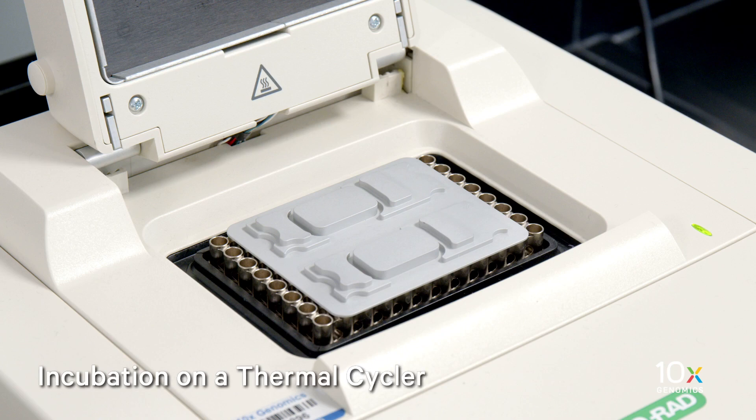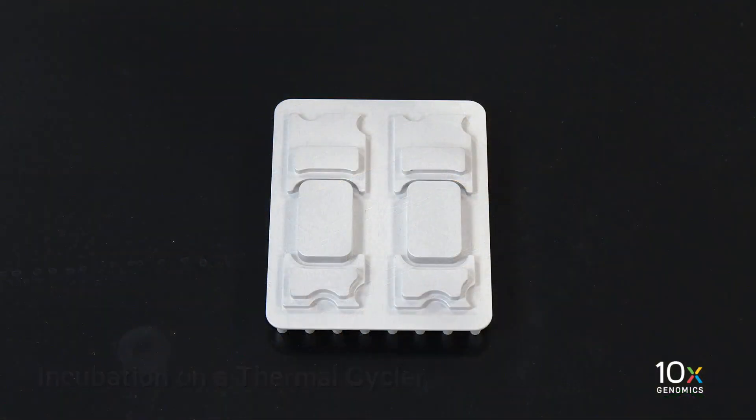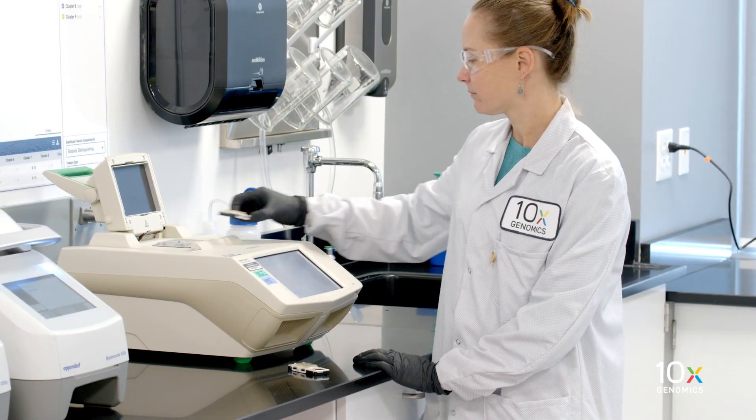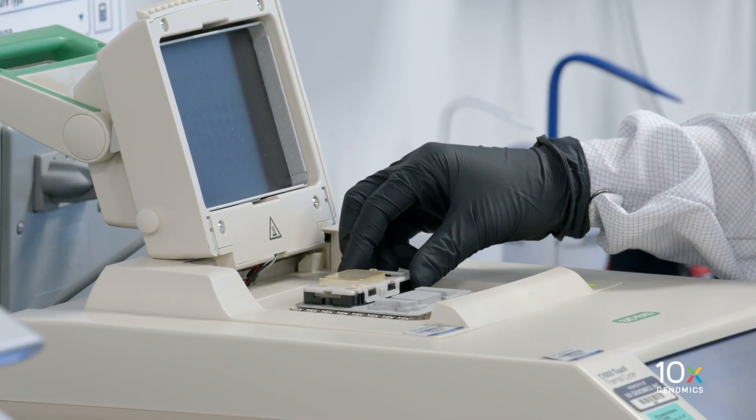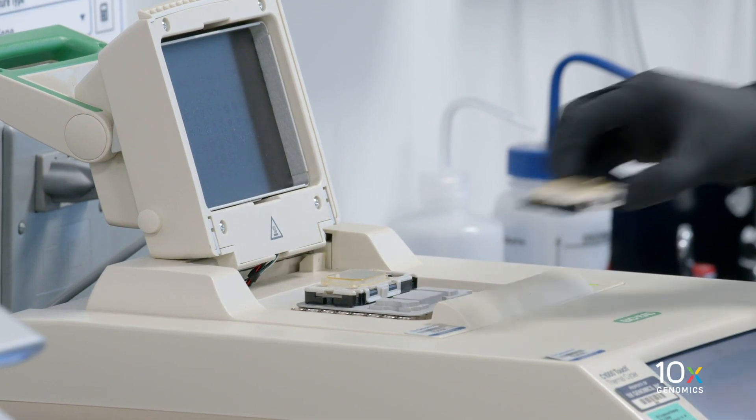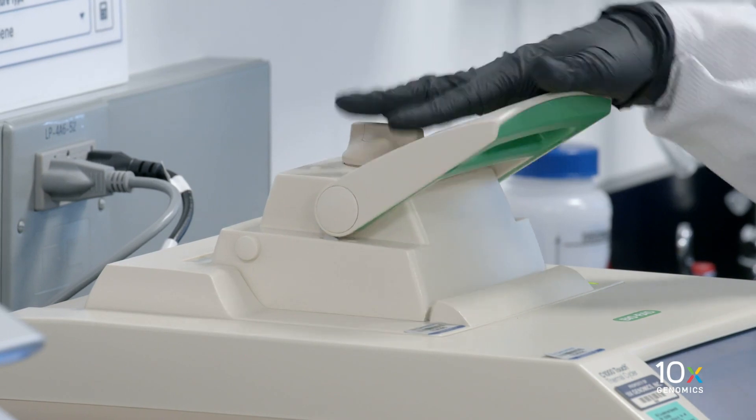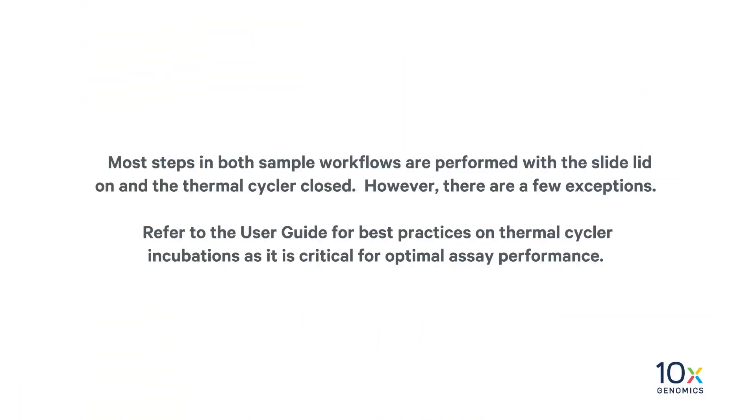Next, we will demonstrate incubation on a thermal cycler. The assay workflow requires multiple incubations on a thermal cycler using a Xenium specific thermocycler adapter. Place the sealed slide cassette on the thermocycler adapter, then close the lid and follow the incubation protocol in the user guide. Most steps in both sample workflows are performed with the slide lid on and the thermal cycler closed. However, there are a few exceptions. Refer to the user guide for best practices on thermal cycler incubations as it is critical for optimal assay performance.